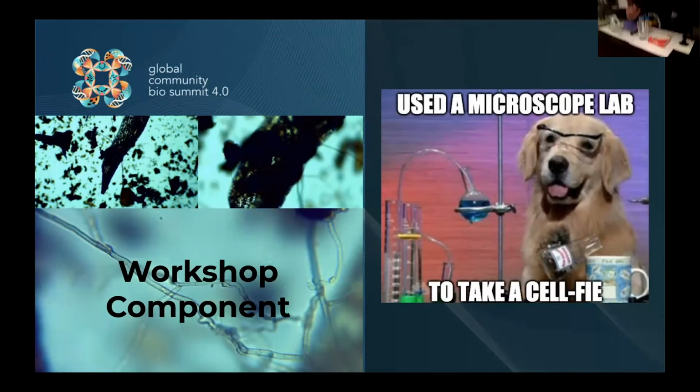First things first, pretty important, you need a microscope, a compound microscope that has an iris diaphragm, so you can control the light balance, because we're going to be shadowing, since a lot of these microbes are transparent. If it's all blown out, if you can't control the intensity of the light with the iris diaphragm, it's going to be hard to see the microbes in general.